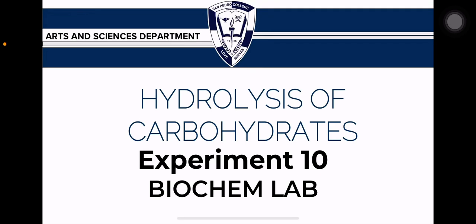Good day, everyone. Today we're diving into experiment number 10, hydrolysis of carbohydrates. This laboratory activity focuses on understanding how complex carbohydrates, specifically starch and glycogen, are broken down through hydrolysis, and how we can detect the progress of that breakdown using the iodine test. This topic is foundational because carbohydrate metabolism is central to clinical chemistry and human physiology.